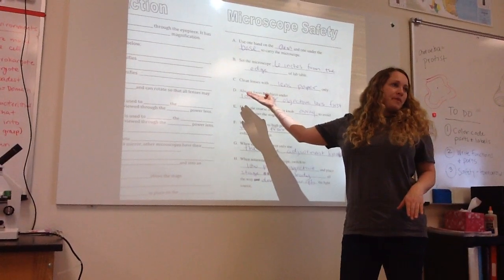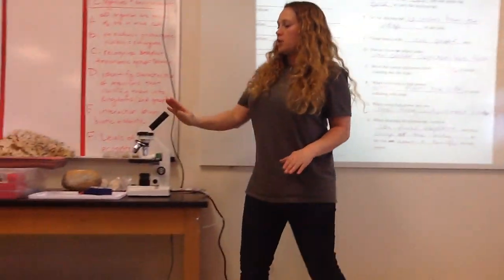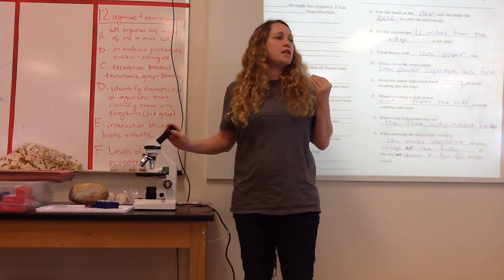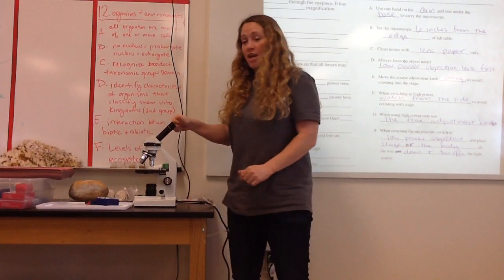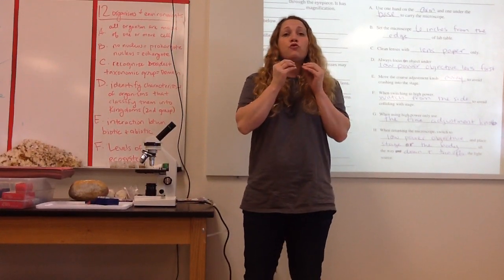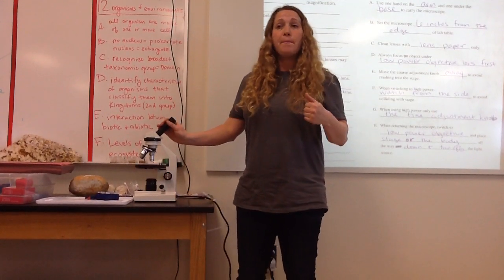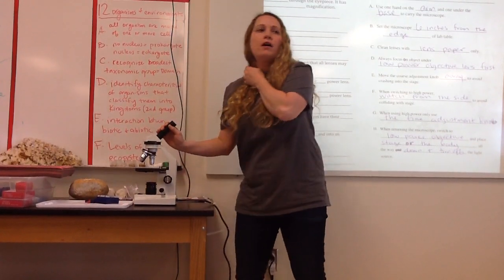Step 3. Clean the lens with lens paper only. So the glass on the microscope is very important. It's delicate. It's a fine glass so that you can see really well. If you use your t-shirt or your finger or your backpack or some piece of cloth, there's going to be little pieces of grit in it. Then when you rub them on there, guess what will happen to your delicate glass? It'll get scratched up. Then you go to look in your microscope and guess what you're going to magnify?